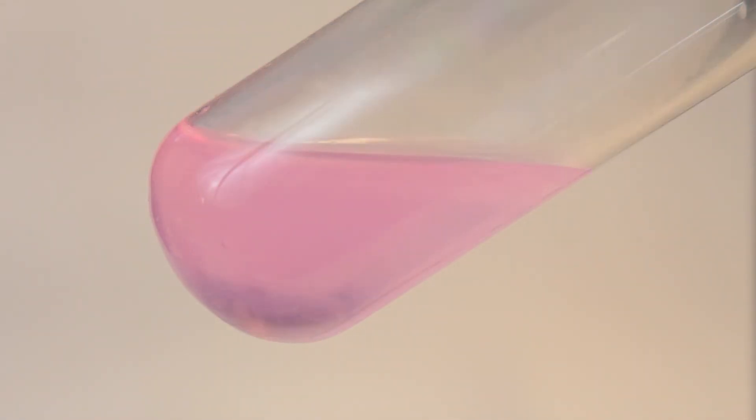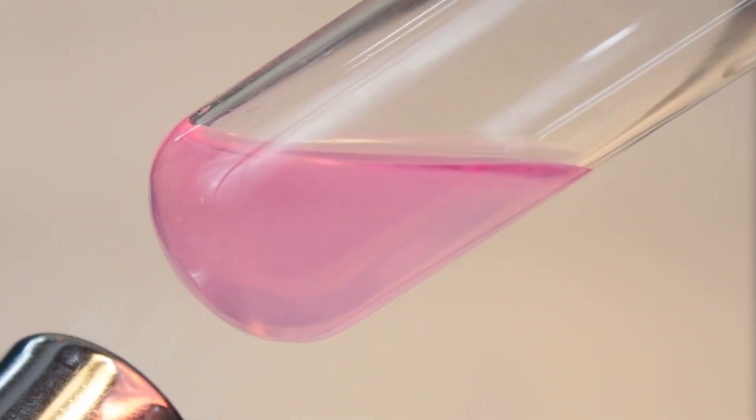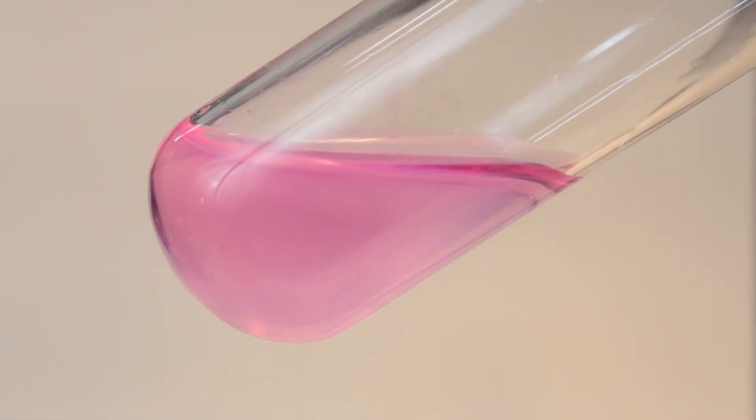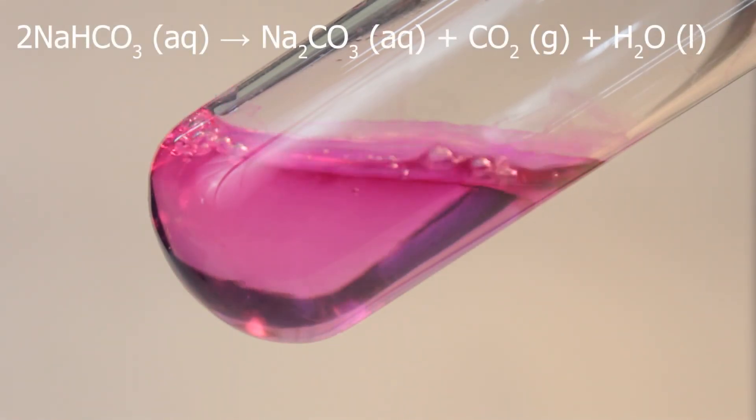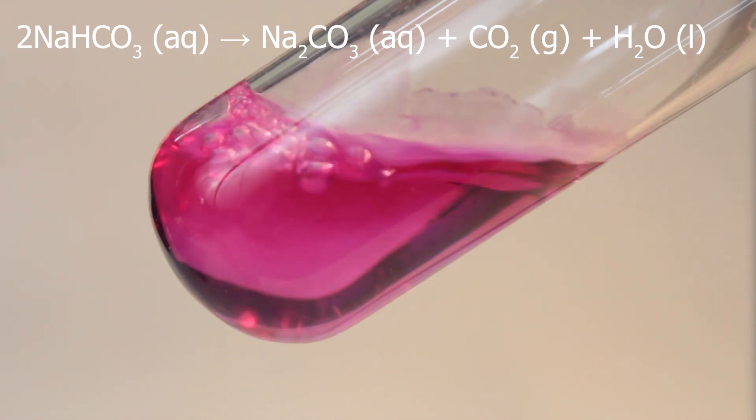And then let's heat it up. Production of carbonate, which is a strong alkaline, would drive pH up, causing the change of the color for the indicator.